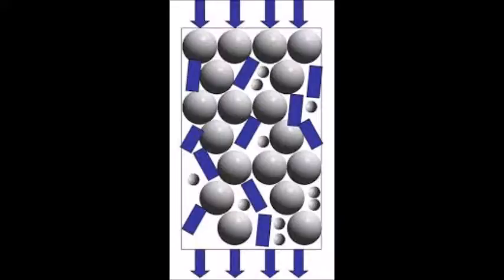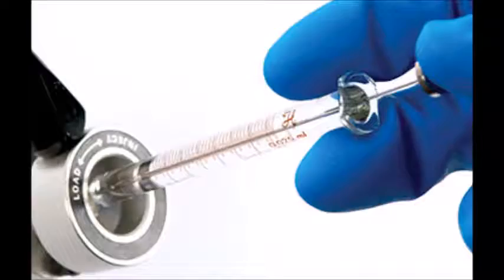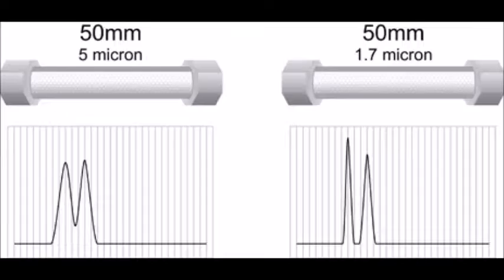A stationary phase is a solid coating or packing in a column that attracts certain analytes due to the chemical structure or reactivity based on the polarity and size of the components. There are 2 types of HPLC analysis referred to as normal phase and reverse phase. Reverse phase uses a polar mobile phase and a hydrophobic stationary phase. Hydrophobic molecules will absorb into the stationary phase, and any hydrophilic molecules will elute from the column first. In normal phase, the stationary phase is polar and the mobile phase is nonpolar. The stationary phase's particle size also varies when determining the best suited for analysis to allow for varied sized molecules to be excluded.